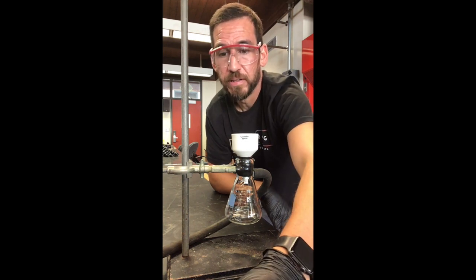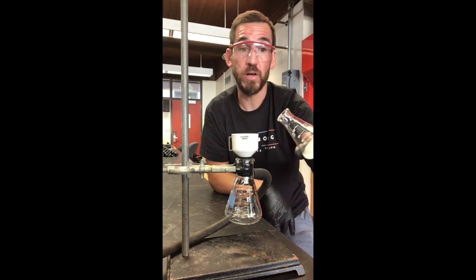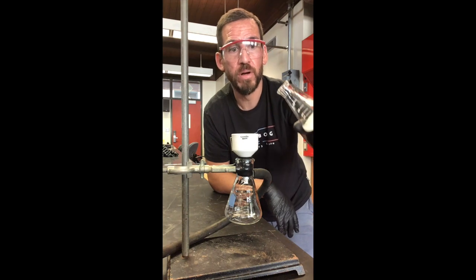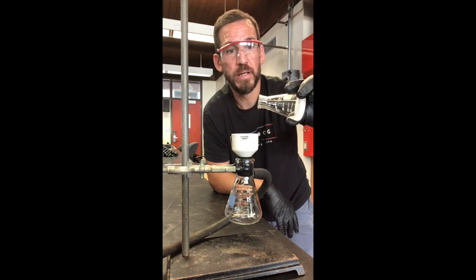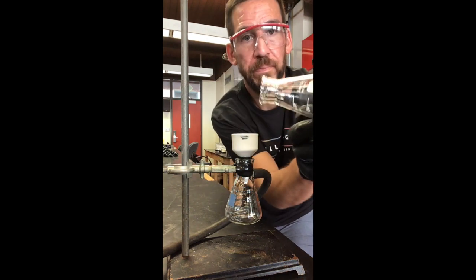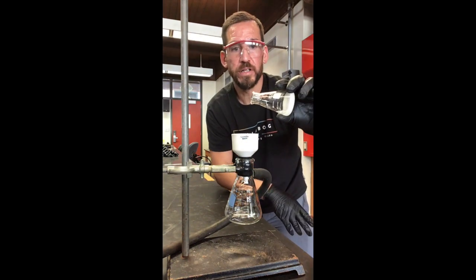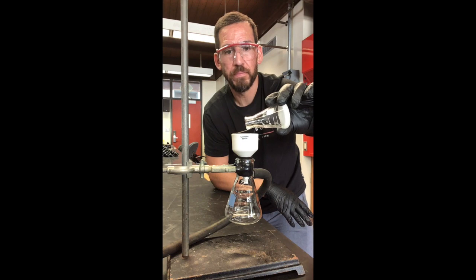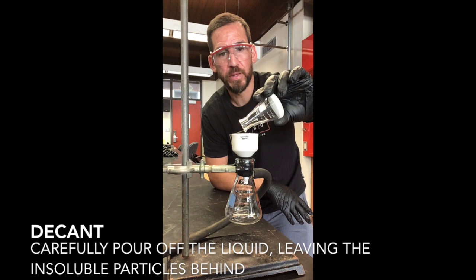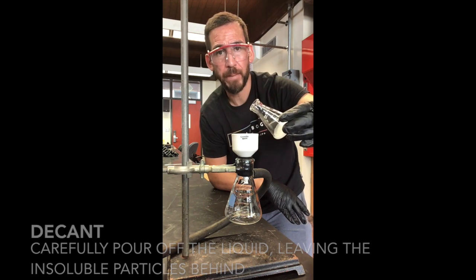Another thing I want to mention is if we're crystallizing sugar or salt at home, you're not going to really have the same setup, right? And so what you can do is, I'm just going to do this very carefully. You can see the clear liquid right here, right? And so I'm just going to pour that off. And this is called decanting. So when I say decant a solution, I mean pour off the liquid, but leave the solid behind, okay?